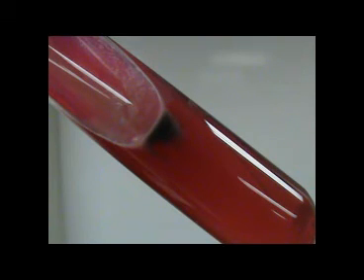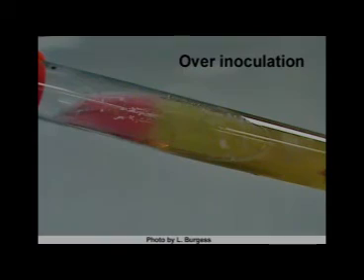During incubation, condensation can often build up in the bottom of the slant. Here, even though a small amount of black precipitate is shown, this is not considered positive for H2S production. In this case, the ferrous sulfate has reacted with some water that has collected at the bottom of the slant, causing the black precipitate to form.